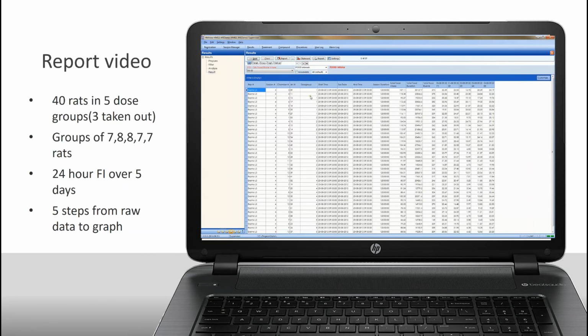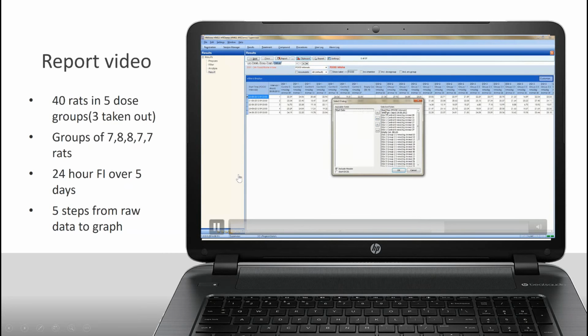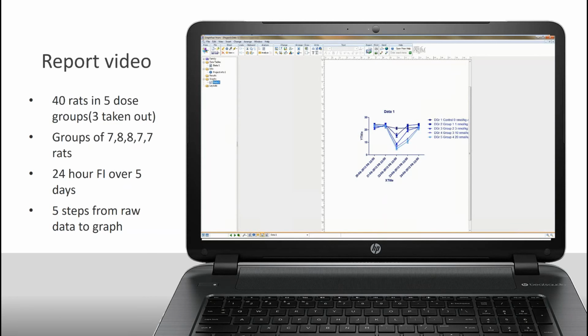Now we need to sort them by groups, and this is for preparing them for the analyzing software. Now we see we have sorted them by groups and selected vertical mode. Here we see on the first group that we have an empty column because there's only 7 animals in this group, so number 8 is just a clear field. You select clipboard and 1-day interval, and then you can paste it into your analyzing and visualization software. In this case, it's GraphPad Prism, but it can be any other program that you're using. Then you have the graph. You can do this in 1 minute if, of course, you have the routine and the pre-prepared reports and the analyzing software as well. So I hope it makes sense.